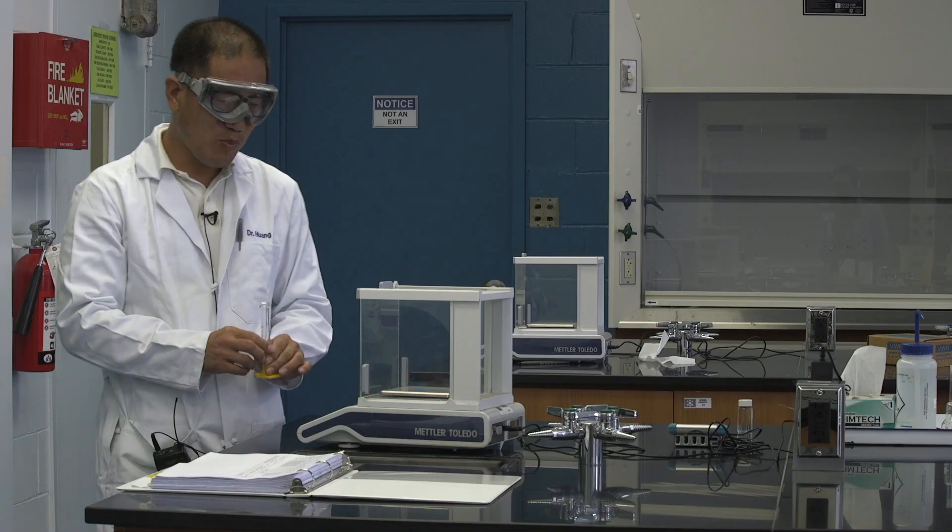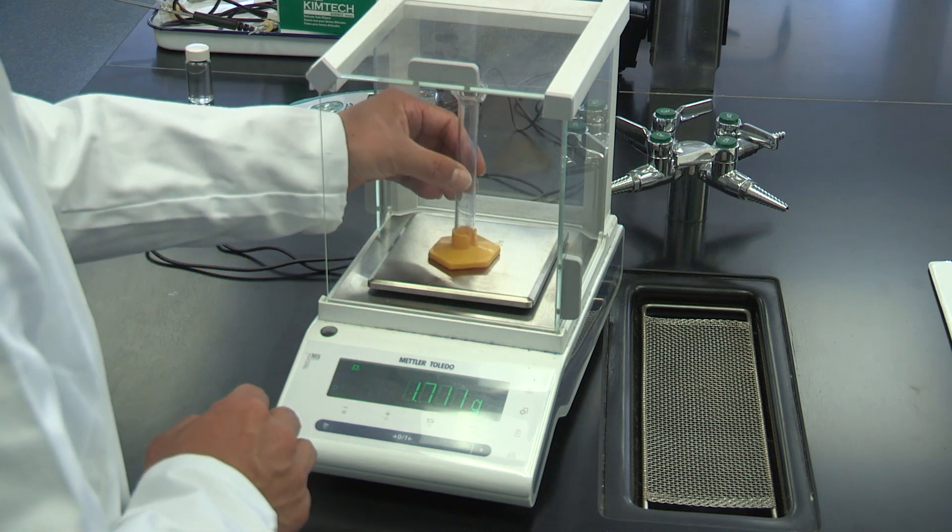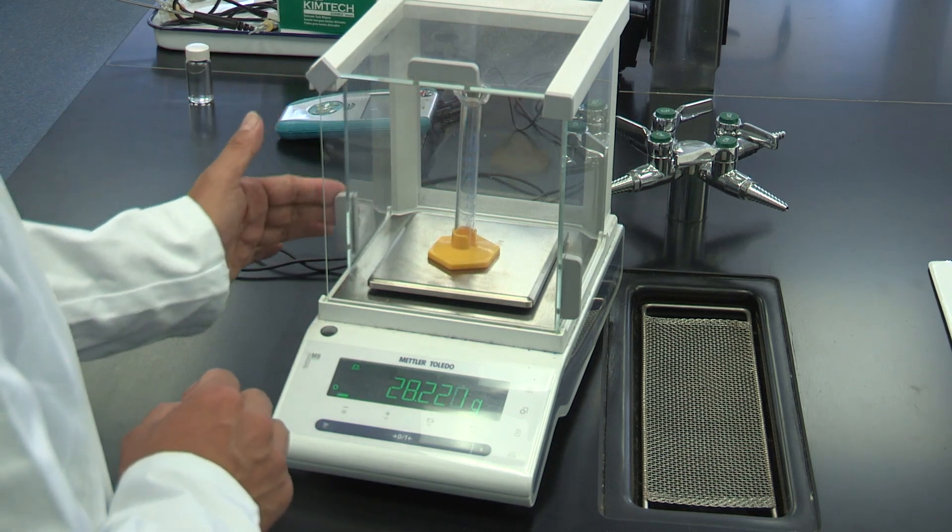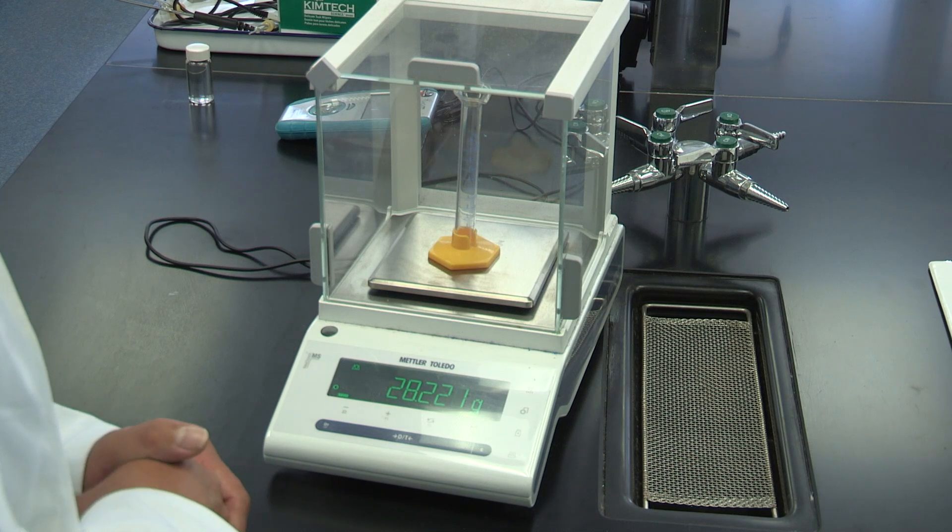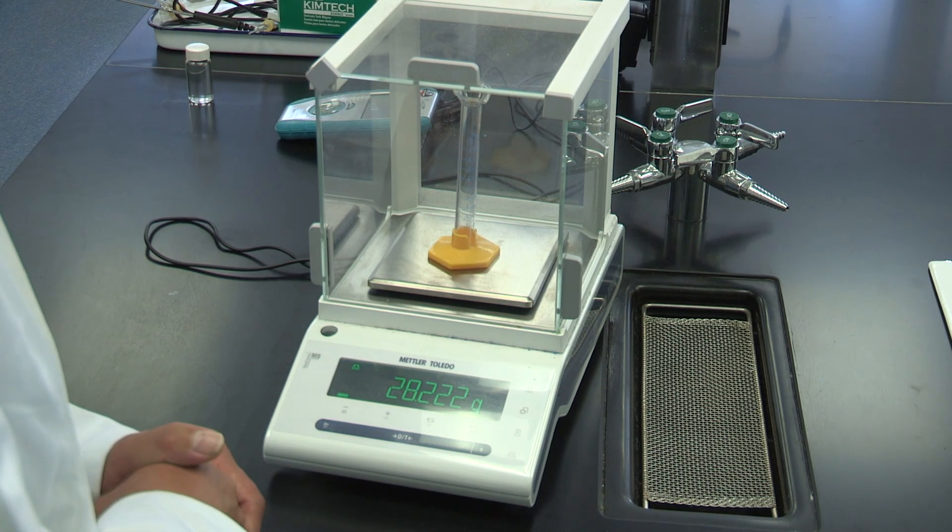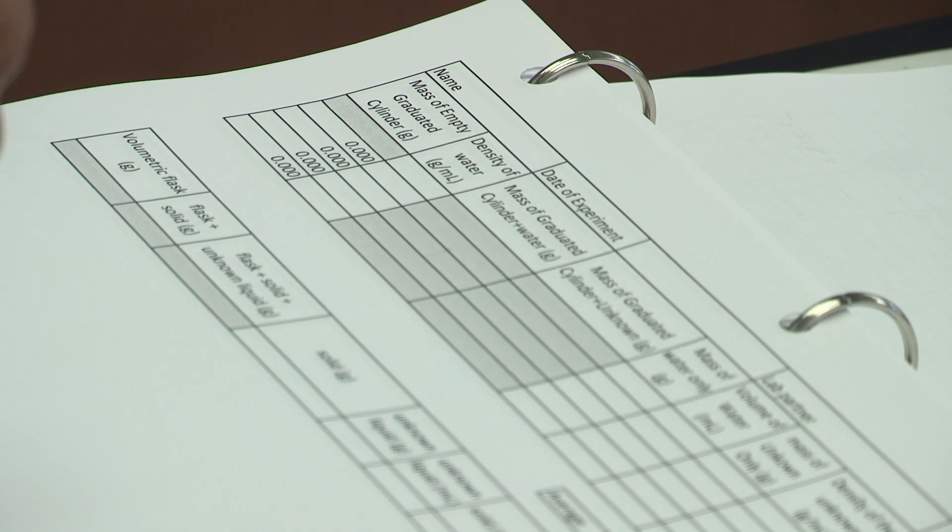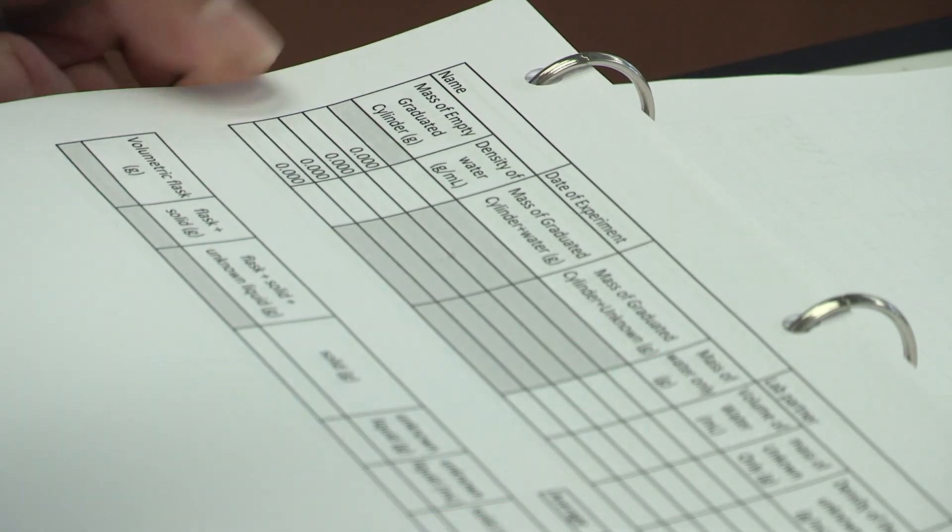We can open the side door and then put the graduated cylinder inside. And then close the door. Let's take the reading. It's 28.222 grams. Whenever you get the reading, you need to immediately write it down with a pen.